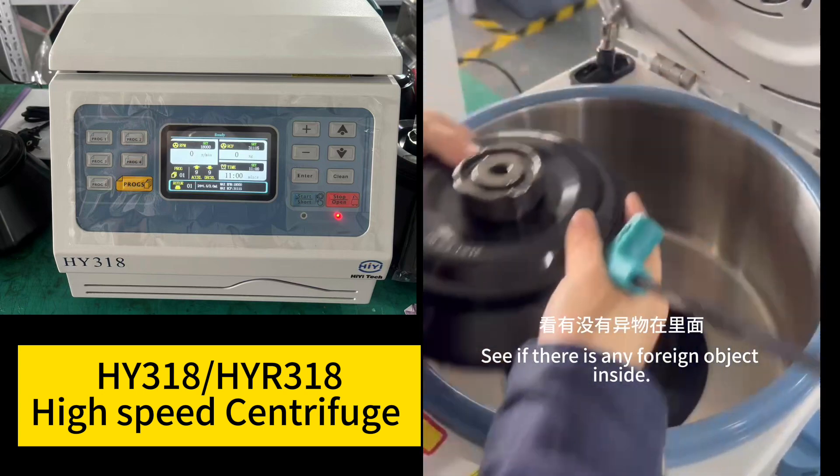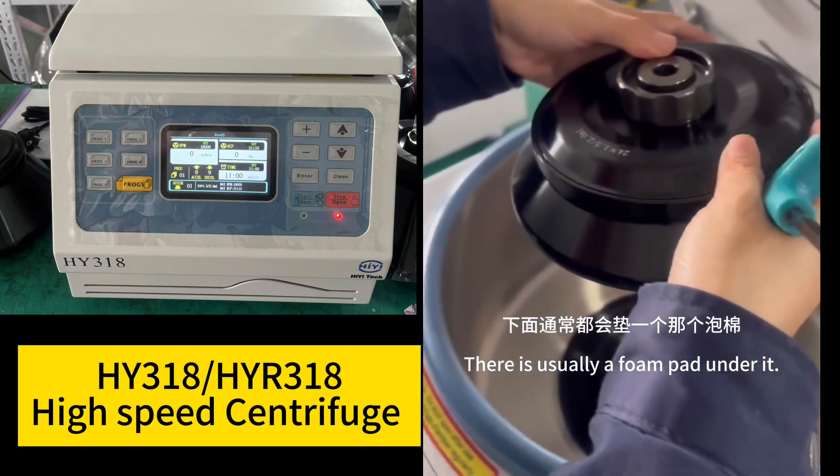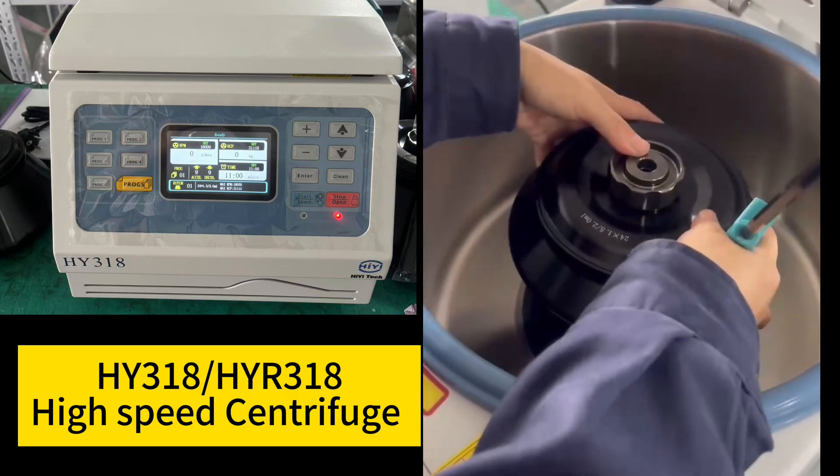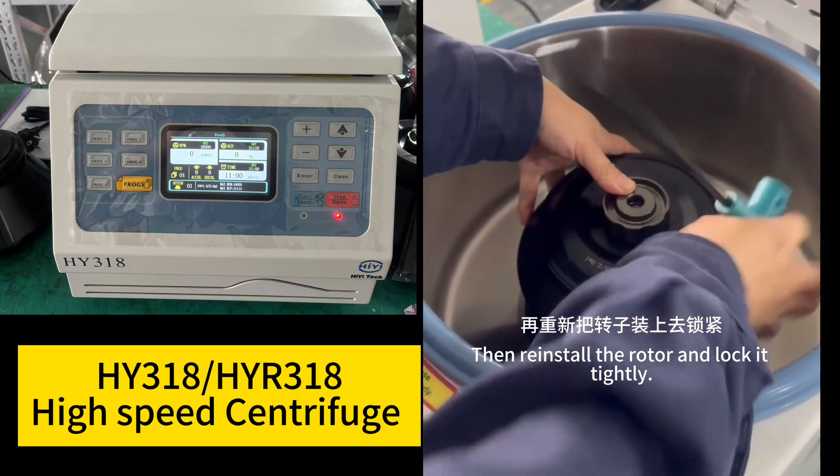Check if there is any foreign object inside — there is usually a foam pad under it. Take it out, and after removing everything, reinstall the rotor and lock it tightly.